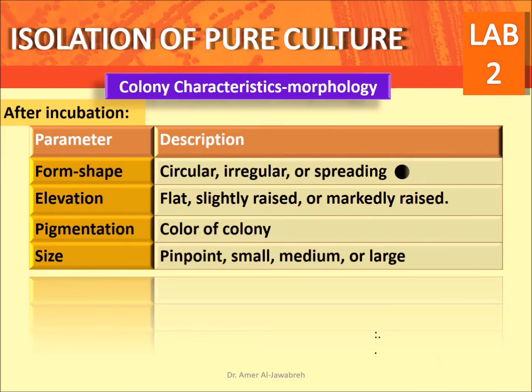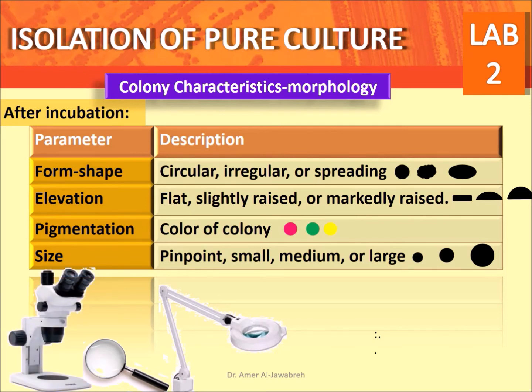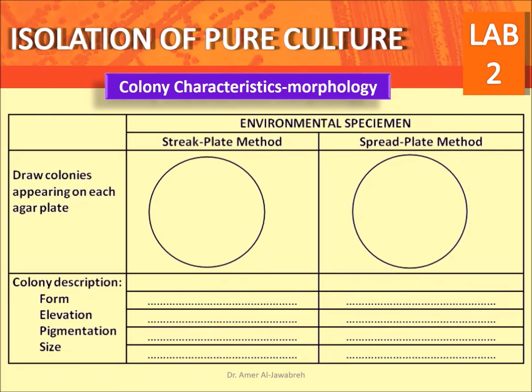After incubation, examine all agar plates and report morphology parameters, including form, elevation, pigmentation, and size, as described in this table. Magnification lenses can aid in viewing colony morphology but it can best be viewed by stereo microscope as it provides a 3D image. A mobile phone camera can also produce detailed magnified images that fit the purpose. Use this form for reporting mix A and mix B results. Use this form for reporting mix C results.